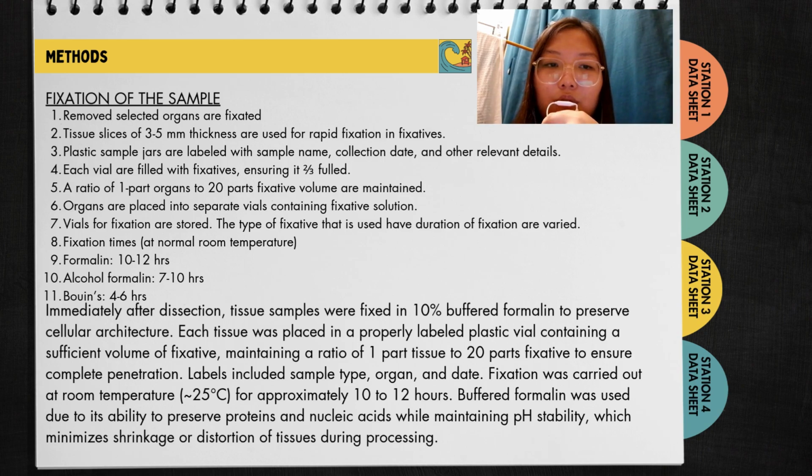Fixation was carried out at room temperature, 25 degrees, for approximately 10 to 12 hours. Buffered formalin was used due to its ability to preserve protein and nucleic acid while maintaining pH stability, which minimized shrinkage or distortion of tissue during processing.